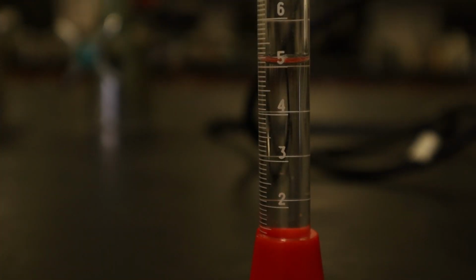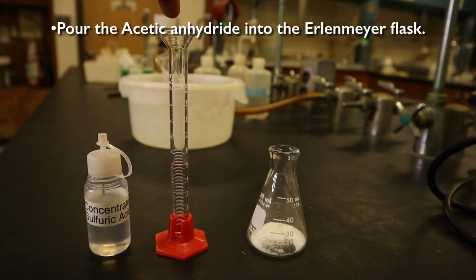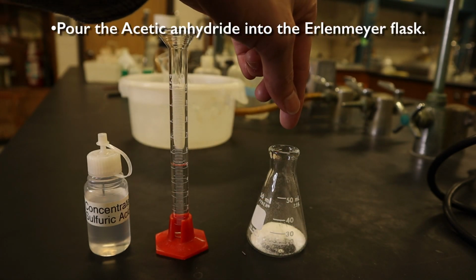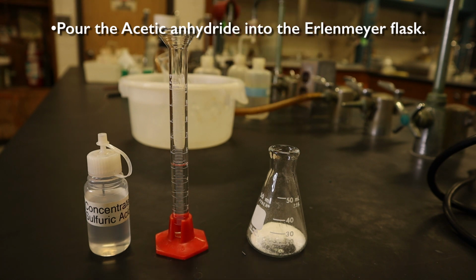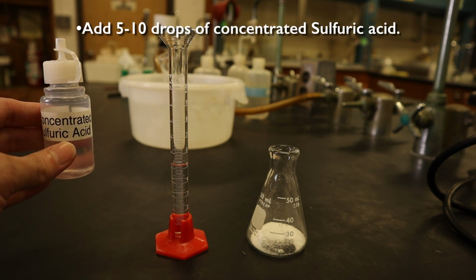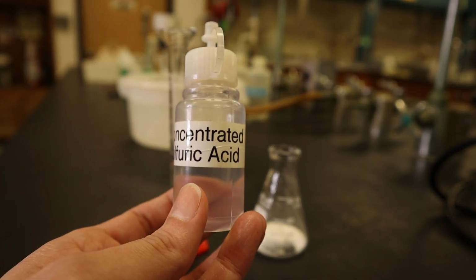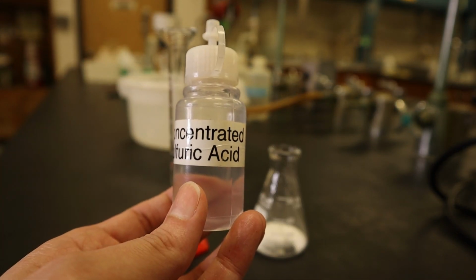Here's a closer look. Now we're going to be adding the acetic anhydride into the 50 milliliter Erlenmeyer flask that contains the salicylic acid, and we're also going to be adding anywhere between 5 to 10 drops of concentrated sulfuric acid. The concentrated sulfuric acid will be acting as the catalyst in this reaction.